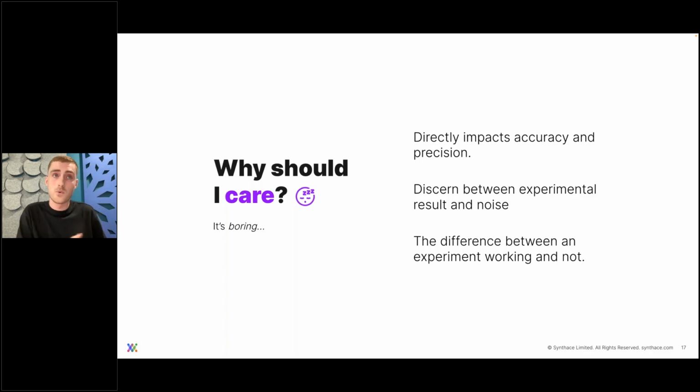Let's be honest, liquid classes are a boring concept. Let's not pretend that tweaking a liquid class is on a scientist's bucket list. Why would we want to spend all that time tweaking something that we do naturally? Something that until automation was a thing we'd done without thinking. But once you optimize your liquid handling, not only will that experiment on the Hamilton, Fluent, Evo actually work, but you'll have confidence in your results.